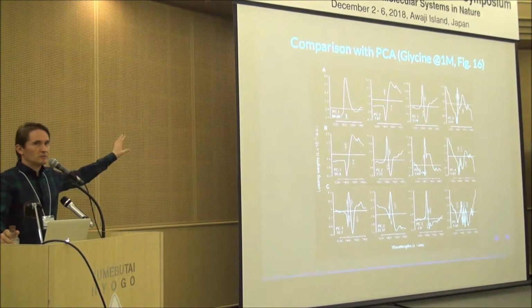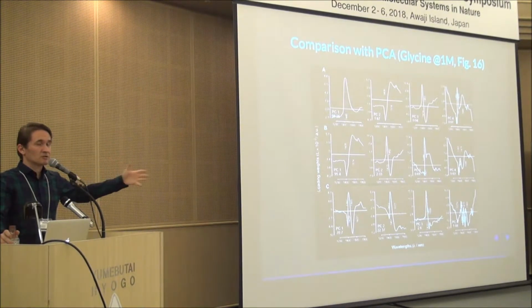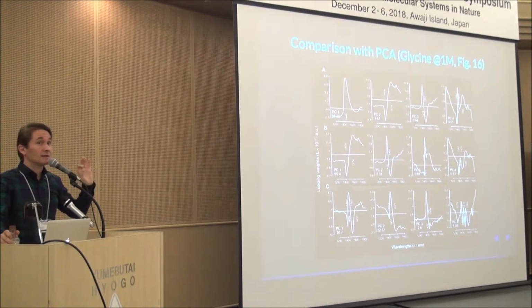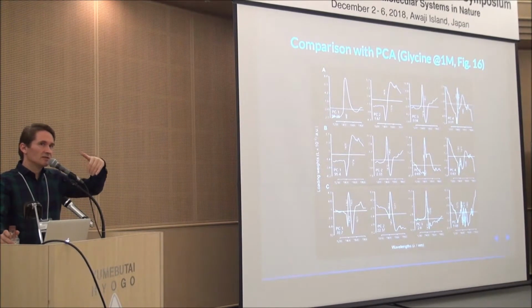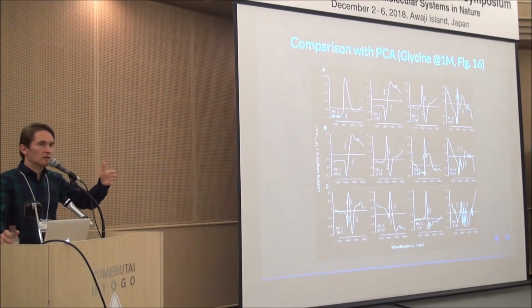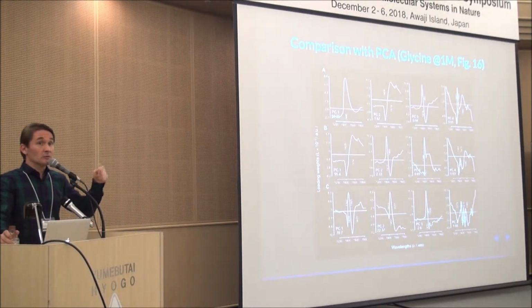That was 11,000 spectra taken over a couple of years. But I didn't do any collection. I just gathered what I already had. And that database was not good. It had a lot of spectra, but most of them were focused around room temperature plus or minus 1 degree. So I was pretty vacant a little bit outside of that, but now I'm happy to share that. My technique is now taking just a few hours, and you can take 10 times better, like 5 times less spectra. However, what you asked is, can we go less than that?